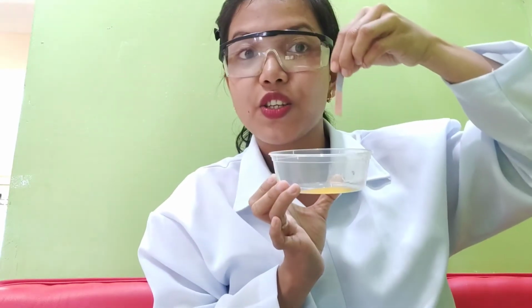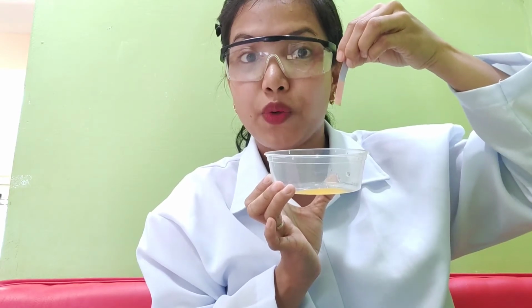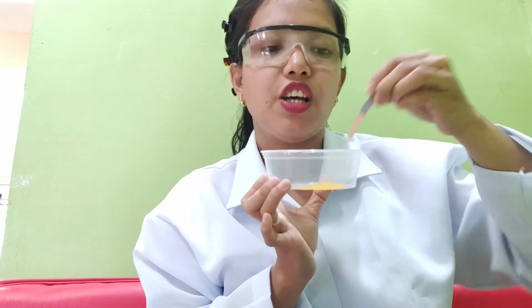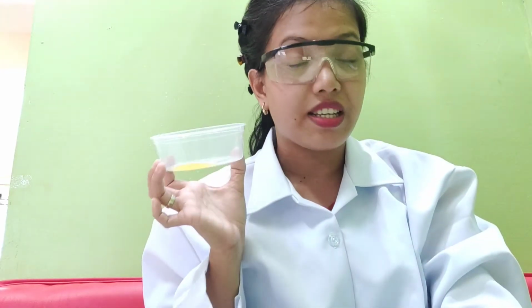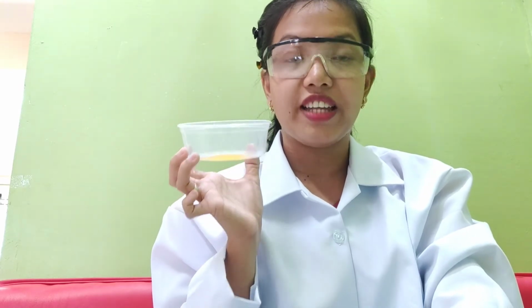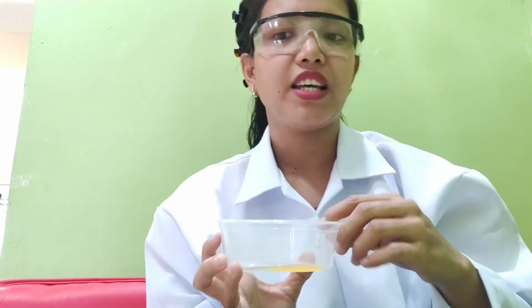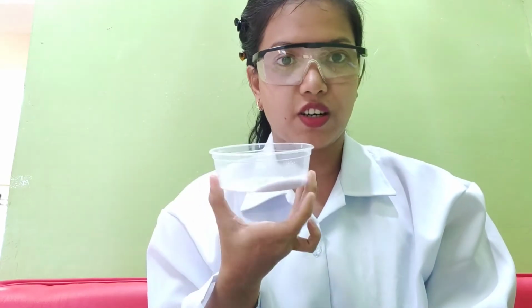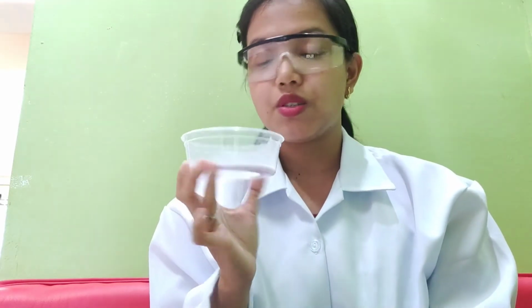Okay, so the blue litmus paper changes color, it turns red. Okay, so orange juice is an example of an acid. Okay, next, how about this one? This is an example of a soap solution. Okay, a soap solution, so this is soap. It's a liquid soap.